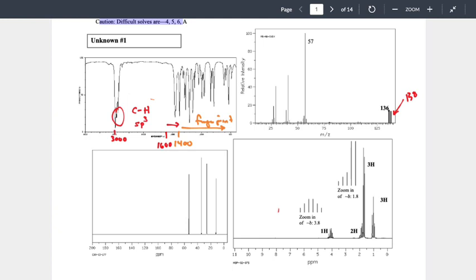So if iodine is in your compound, your molar mass is genuinely huge. Even the smallest mass is like 140, and that's a really, really simple molecule. What we're talking about for large masses with iodine is like 200-300. If you're seeing masses in that range, iodine could be present. That could be a large contributing factor to the overall molar mass. It's also possible you just have a ton of carbons or oxygens or nitrogens. But seeing a large molar mass can be a tip-off that you have iodine.